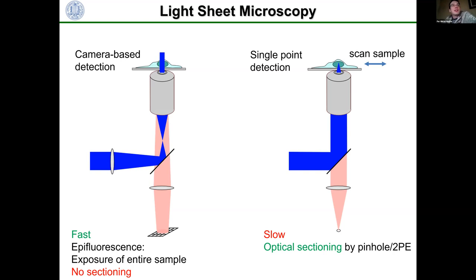Okay, so in general, the most simple camera-based fluorescence microscope would be the epifluorescence microscope, in which you illuminate the sample in the entire axial direction. So everything in the field of view on, below and above is excited. Then you collect the fluorescence and you image it on your array detector, which, for example, can be a CMOS camera or similar, which has many, many pixels.